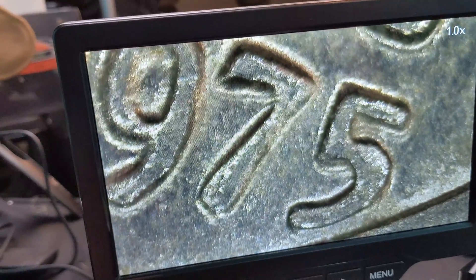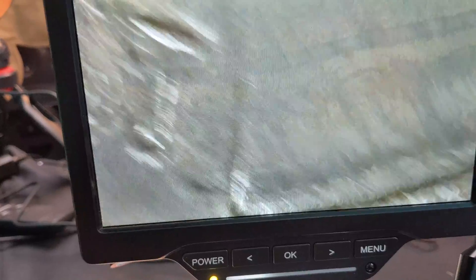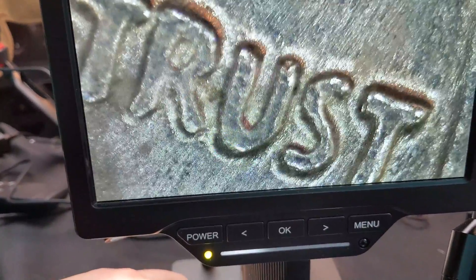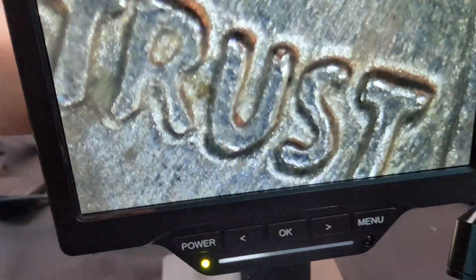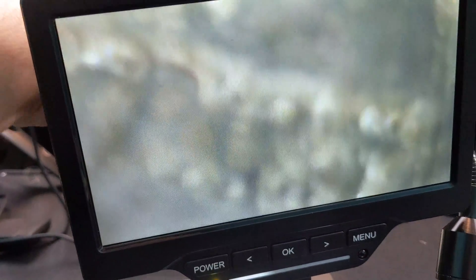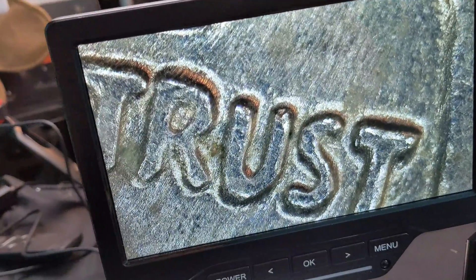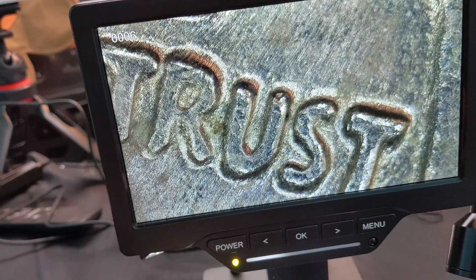Once you have the detail, you can zoom in, take pictures, zoom out, or zoom really far in. Overall, this is awesome — it works great. Turn the black knobs on the back to adjust for clarity depending on the size of the object. Look how clear you can get that. Then just press OK to take a picture.